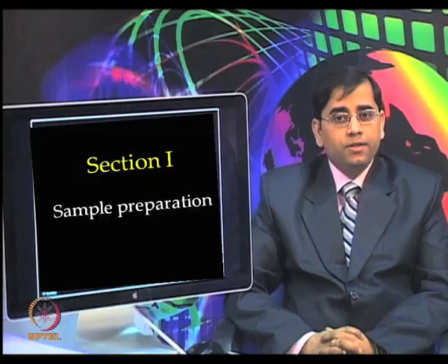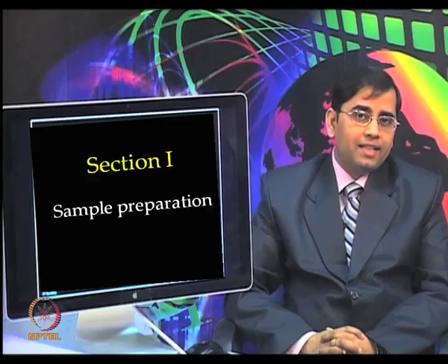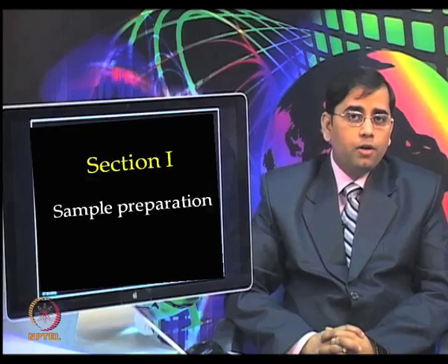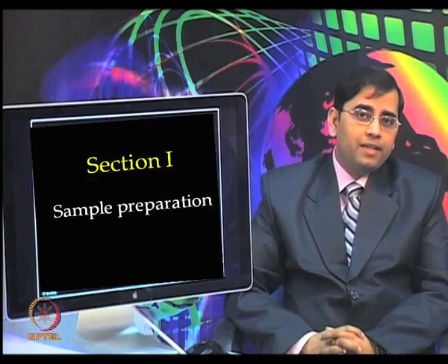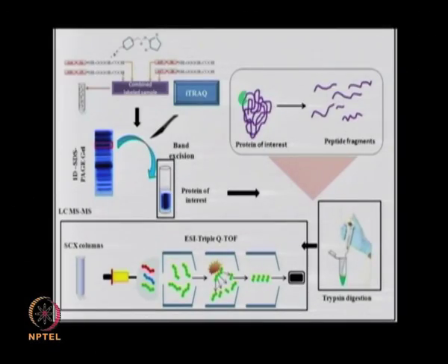The in-gel digestion procedure is compatible with downstream mass spectrometry analysis, whether you want to continue with MALDI TOF or you want to do LCMS based mass spectrometry analysis. In-gel digestion of proteins for MS analysis video.